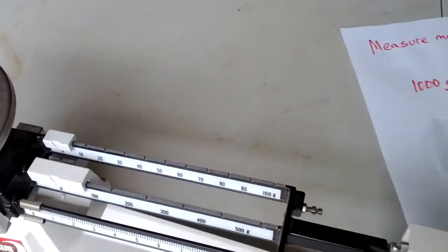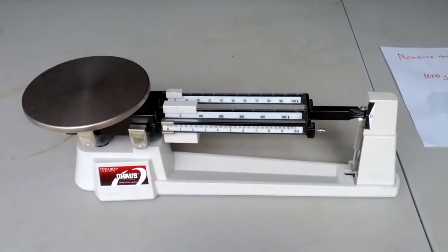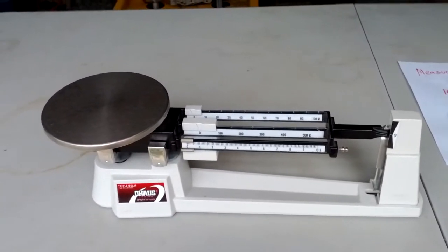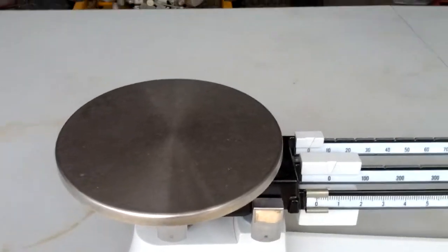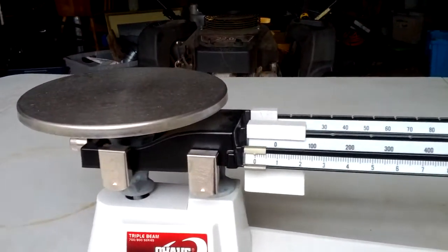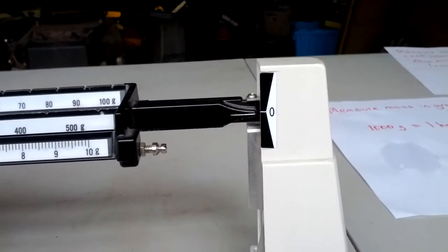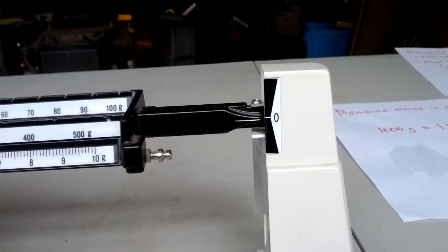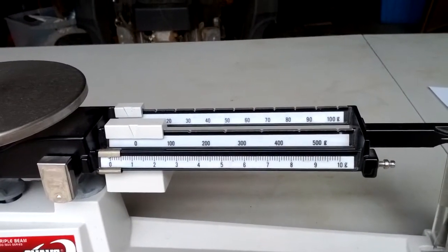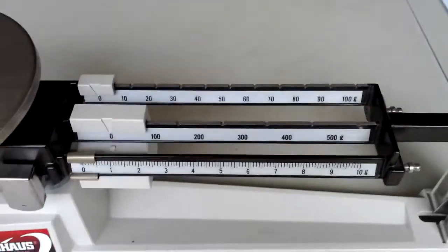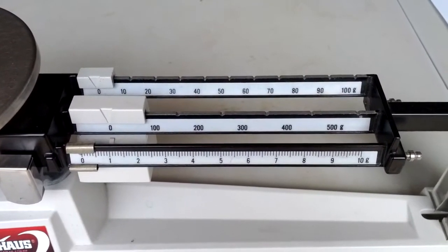We use a triple beam balance to measure mass. You put the object that you want to find the mass of on the pan. But before you do that, you have to make sure that the balance is at zero on the scale. And before you do that, you have to check these little masses that are already on here called riders. There's three riders and there's three beams. So that's why it's called a triple beam balance.